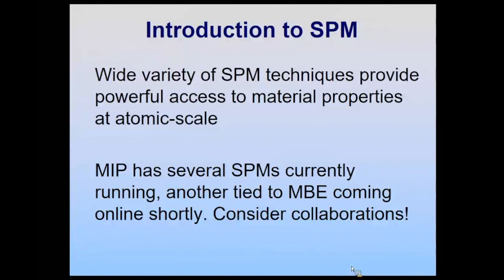In STM, typically you can see charged impurities because if they're charged, they typically appear brighter in the topography, for example, because there's excess density of states there. And STM is easier for doing atomic scale imaging than AFM is. I didn't mention this, but it is certainly possible, as you saw, to do atomic resolution AFM, but it is not trivial.